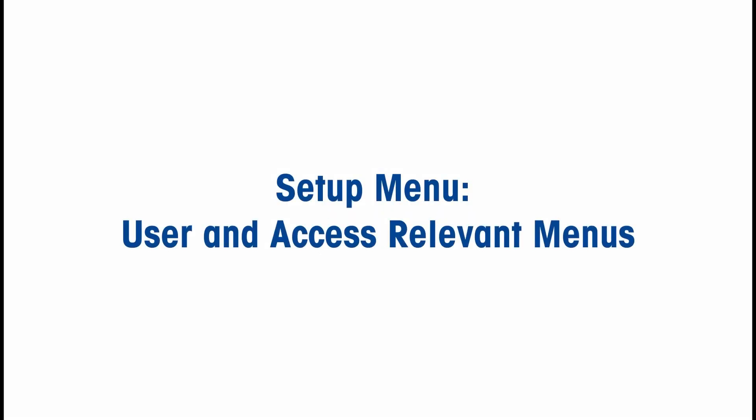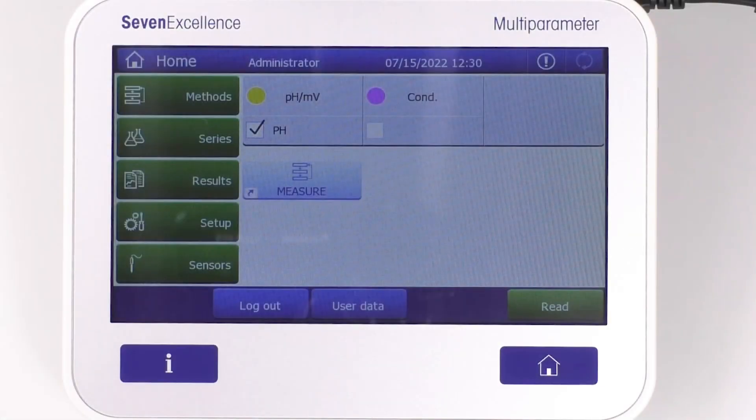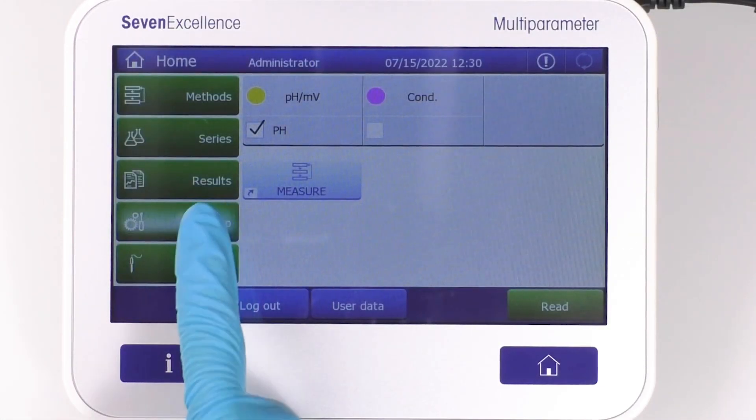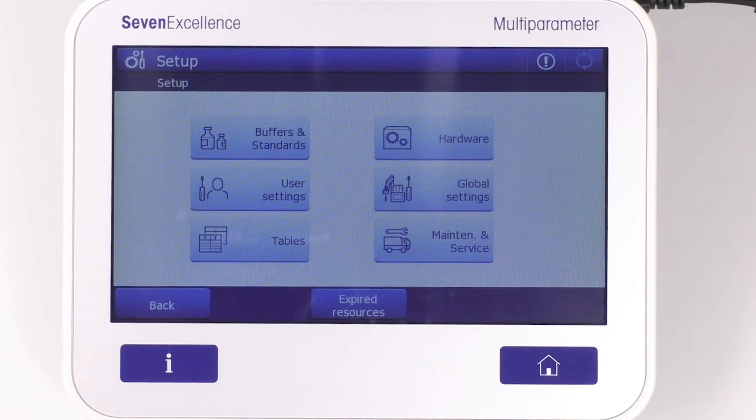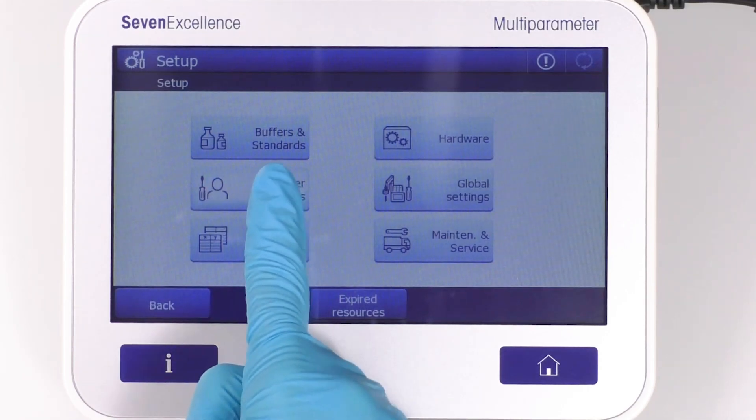In this segment, we will be discussing the user and access relevant menus in the setup. To access these options, simply go to Setup, then click User Settings.